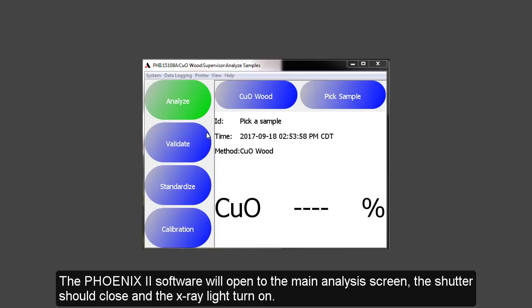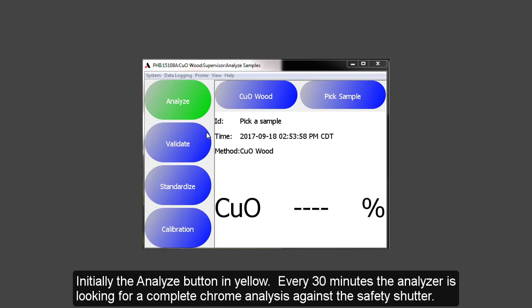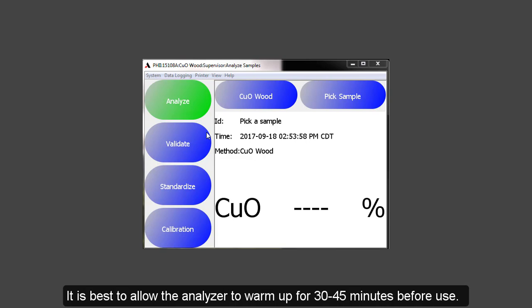The Phoenix 2 software will open to the main analysis screen. The shutter should close and the x-ray light turn on when the software turns on. Initially, the Analyze button is yellow. Every 30 minutes, the analyzer is looking for a complete chrome analysis against the safety shutter. It is best to allow the analyzer to warm up for 30 to 45 minutes before use.